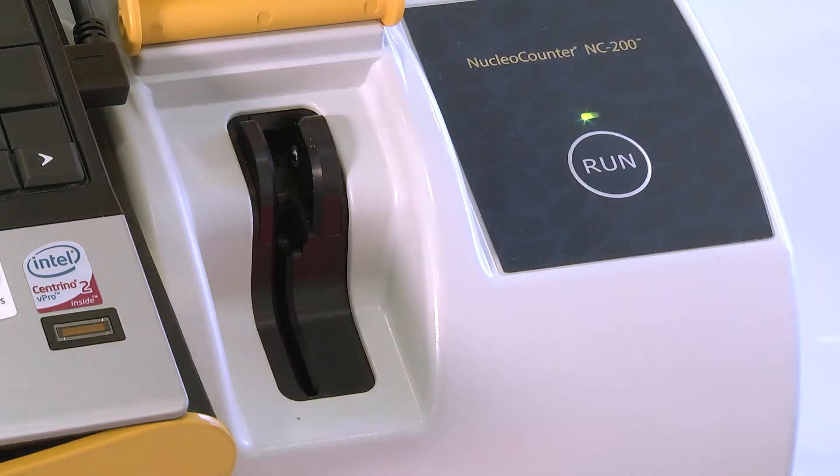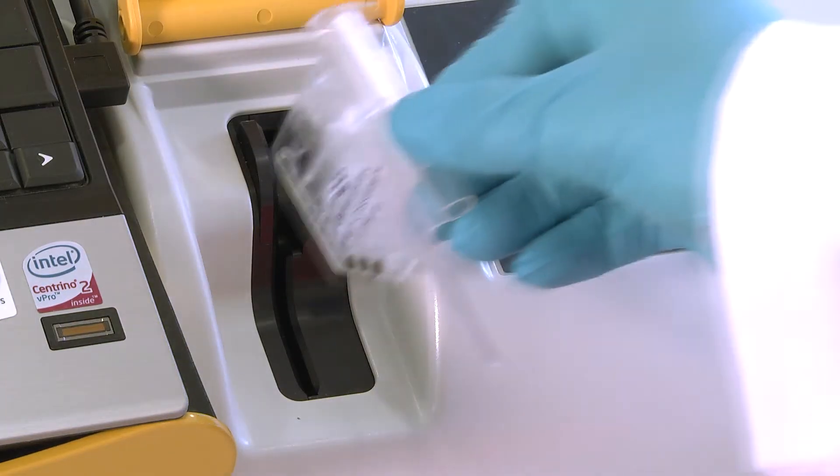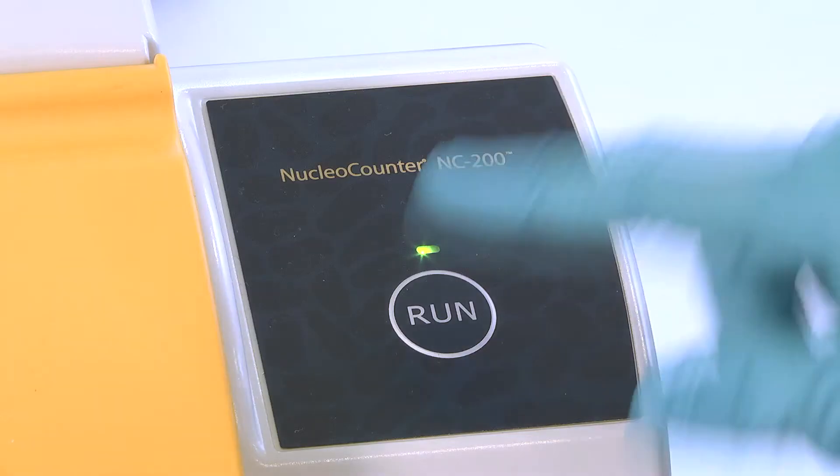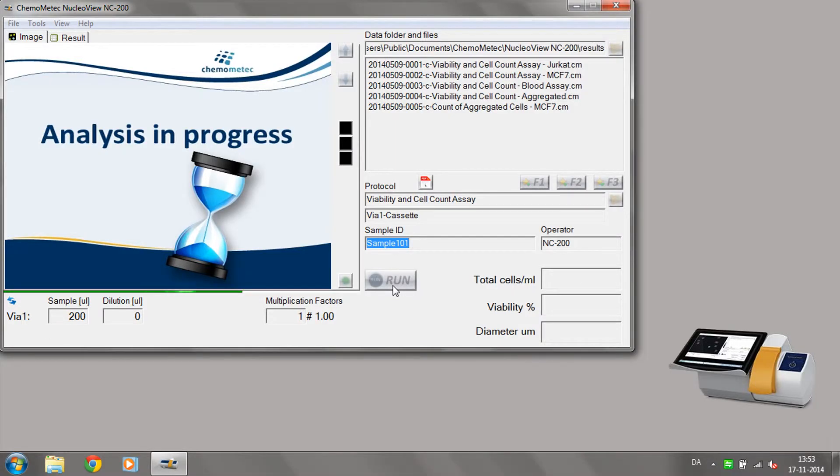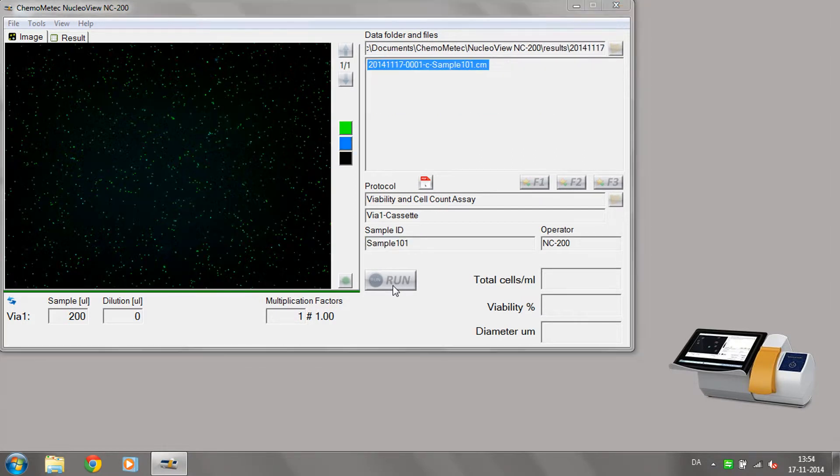The NC200 is 21 CFR Part 11 ready, and with the ability to perform IQ, OQ, PQ, and set your own viability thresholds, it is ideal for GMP environments.